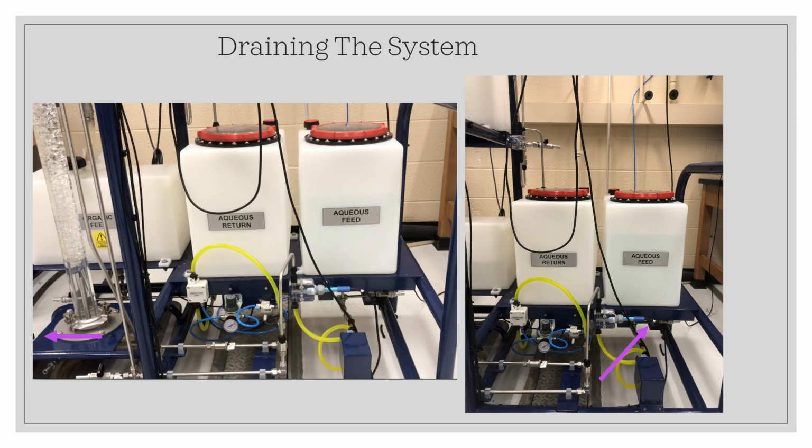Once all trials have been completed for the day, close the software and begin the cleanup procedure. For the cleanup procedure, press the water pump button that shows on the touchpad screen to send most of the organic phase to drain into the organic return tank.